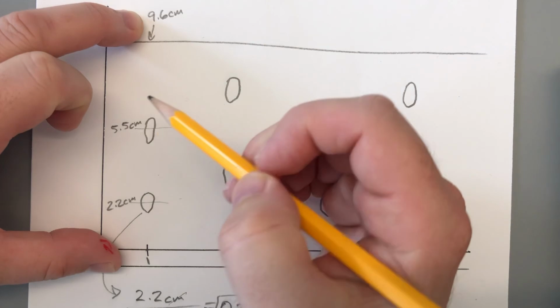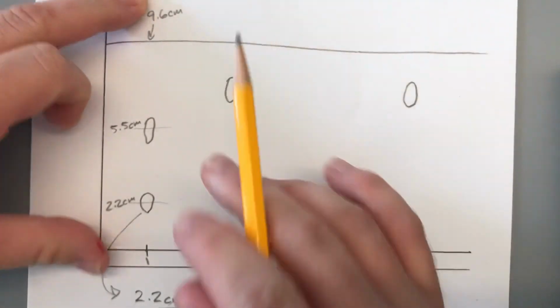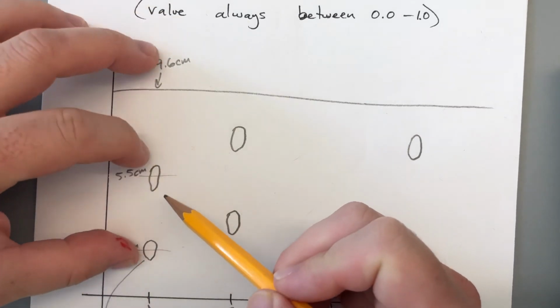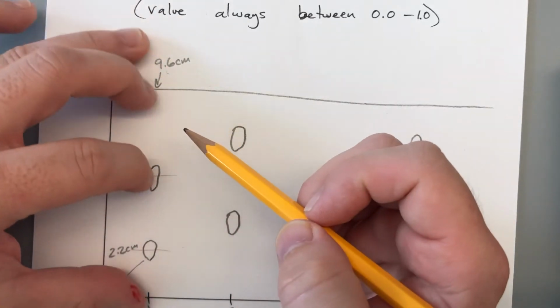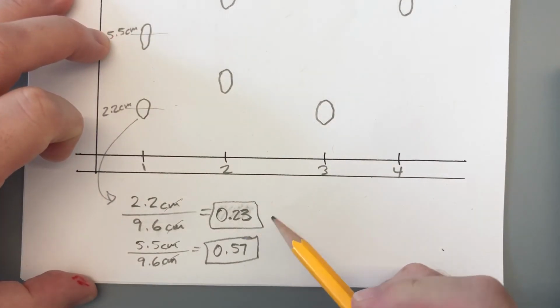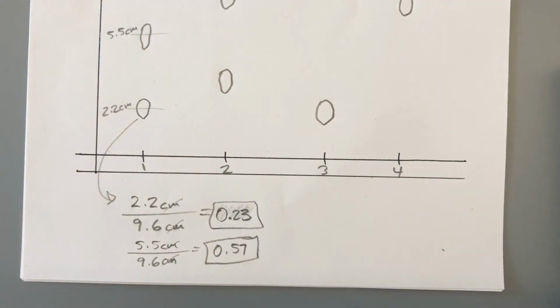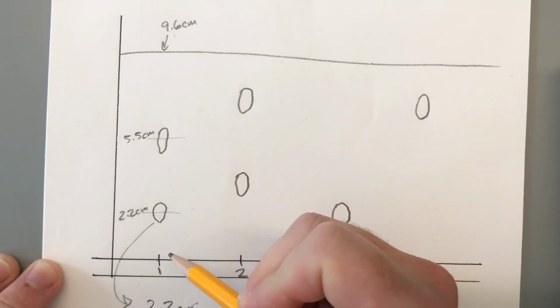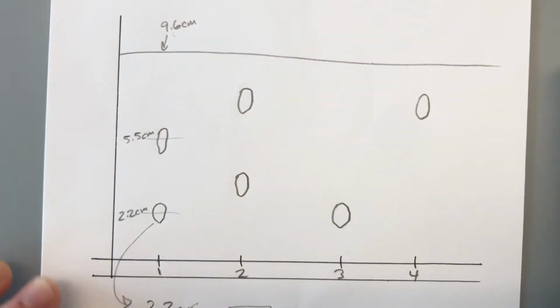Okay. Now, if we had let this go longer, the solvent may have traveled farther, but these would travel at a relative rate. So even if this went longer, you would still get the same relative distance, which is why we do everything in terms of relative distance. We don't actually care how many centimeters this moved. We care about how it moved relative to the total distance here.